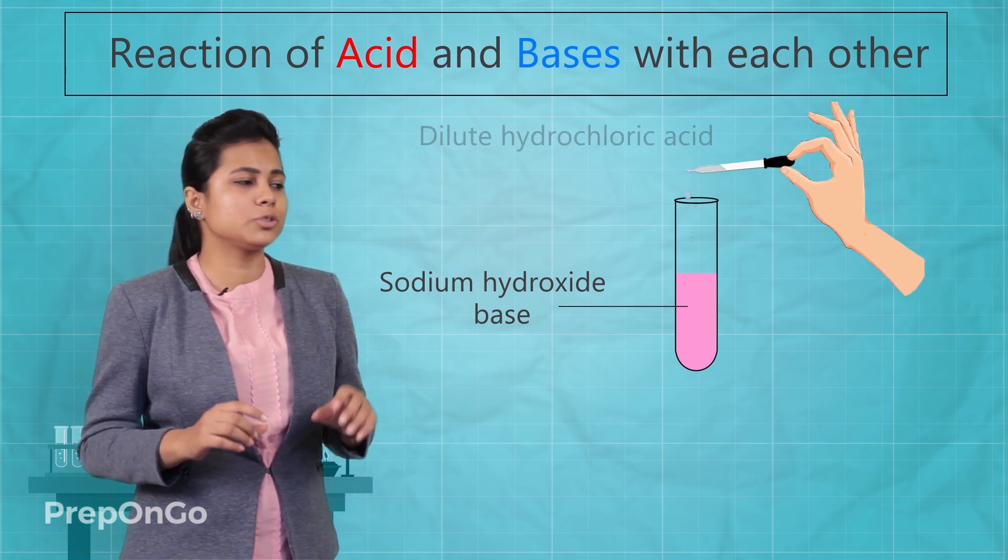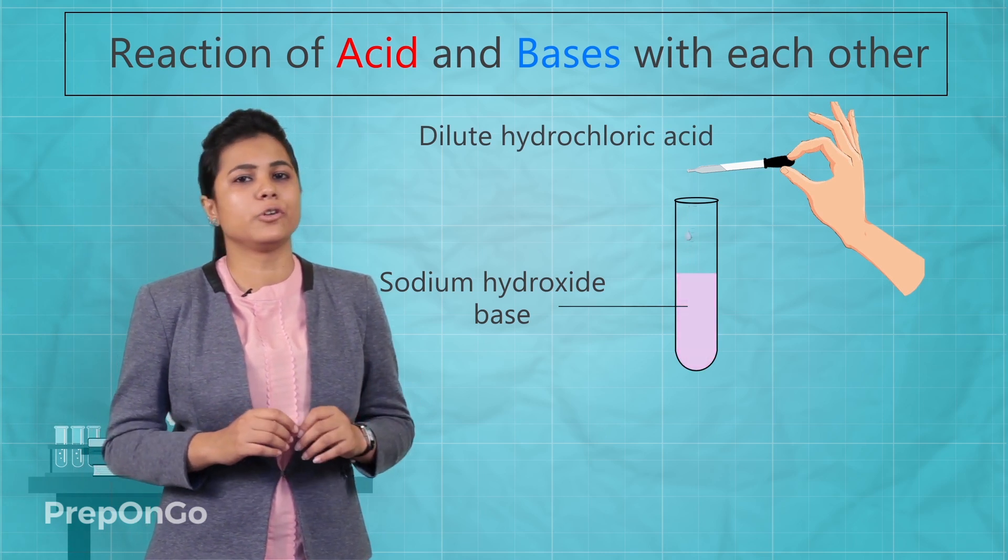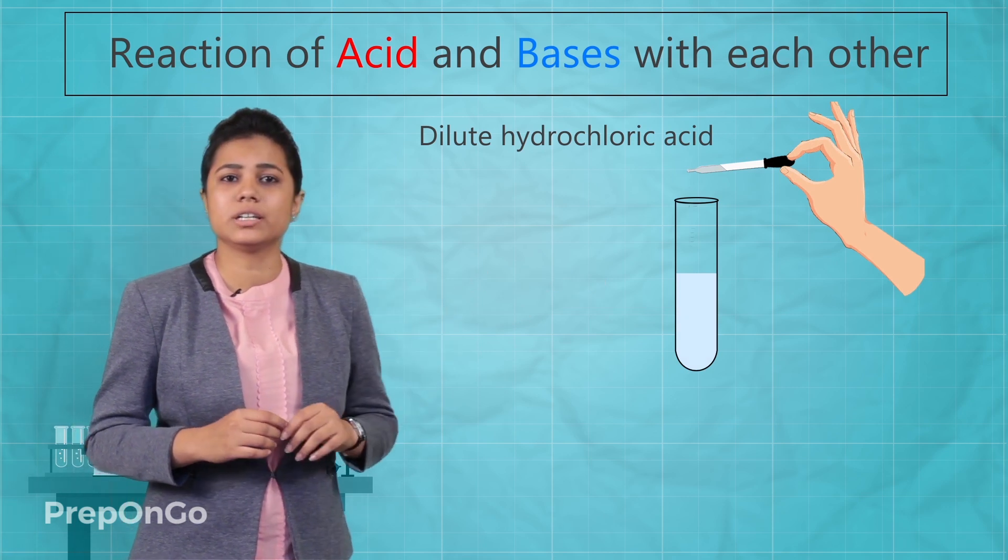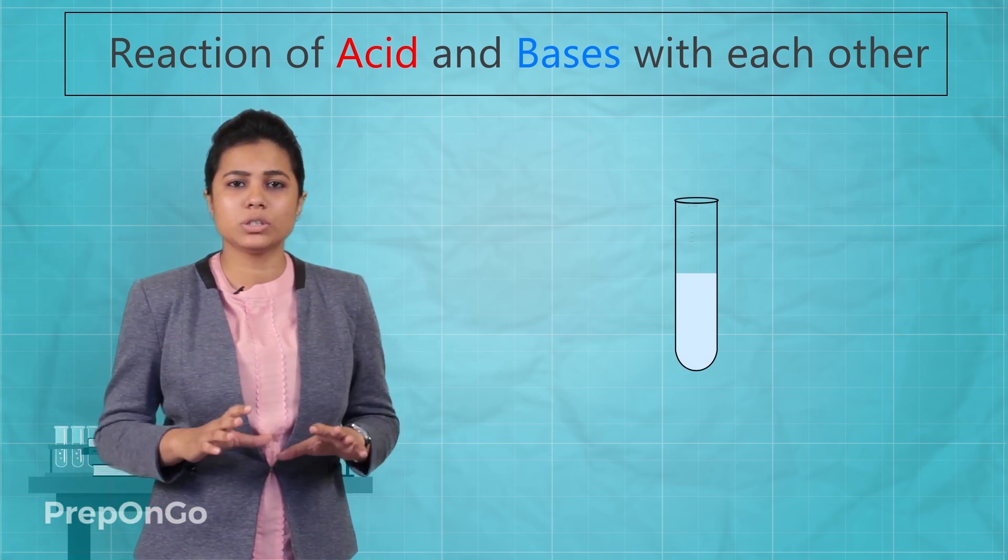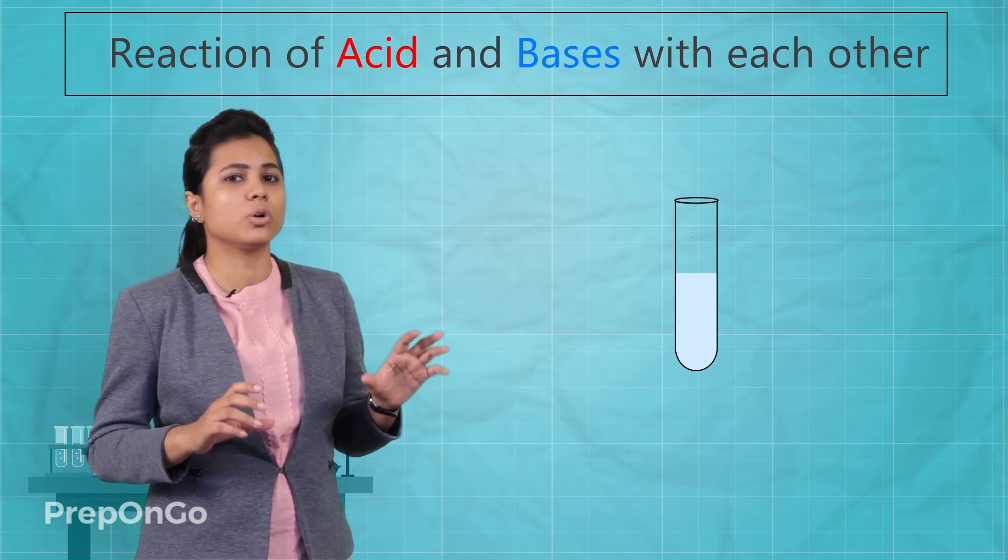Now put a few drops of dilute hydrochloric acid into it with the help of a dropper. You are going to see that the solution has turned colorless which shows that the hydrochloric acid had neutralized the sodium hydroxide.